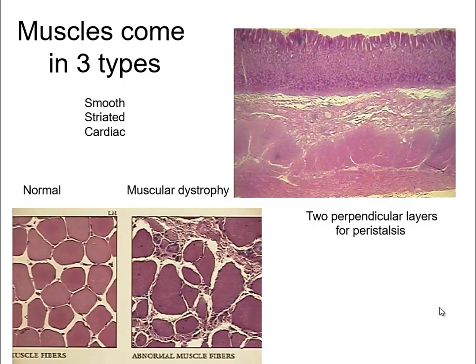Muscle comes in three types: smooth, striated, and cardiac. Smooth is the hardest of the three to identify because it doesn't have a lot of extra markings. It's just a bunch of strings — but if you think about a pot roast and the strings in the pot roast, you'll get an idea, because muscle is actually a series of strings kind of like that.